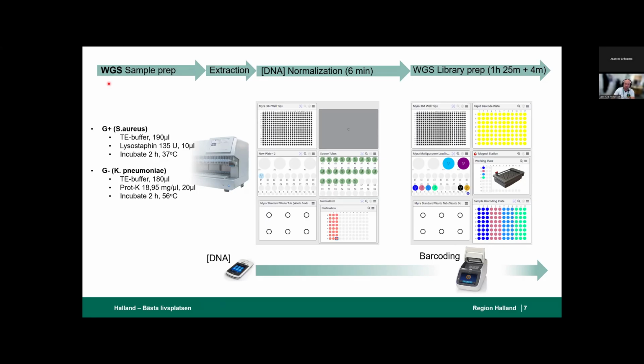So making sure that the extraction platform is up to task is important, and also making sure that the bacteria are properly lysed before the extraction is also key to making this work. These steps might make up for the time gained by not having a PCR step. So all in all, it might take more or less the same time anyway.